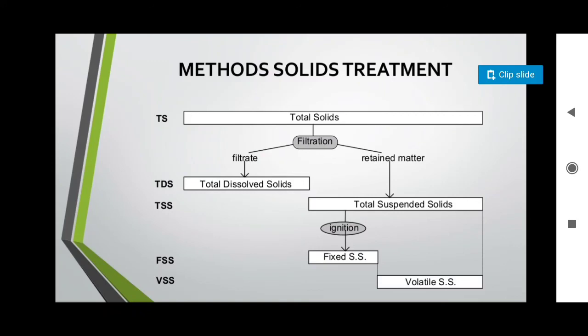solids which are present in water or in wastewater either lead to impurities or lead to different other problems in the reactors also. So we have to understand what the solids present are, because before treatment, right, we have to understand the quality of the influent. So for understanding the quality of influent, we must try to understand what the different types of solids are which are present in a wastewater stream or, in general, in a water stream, right?